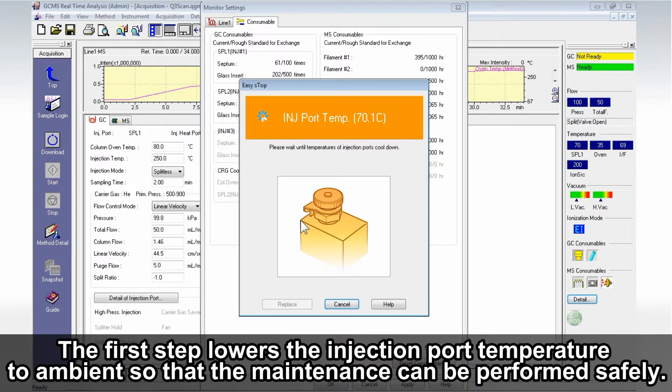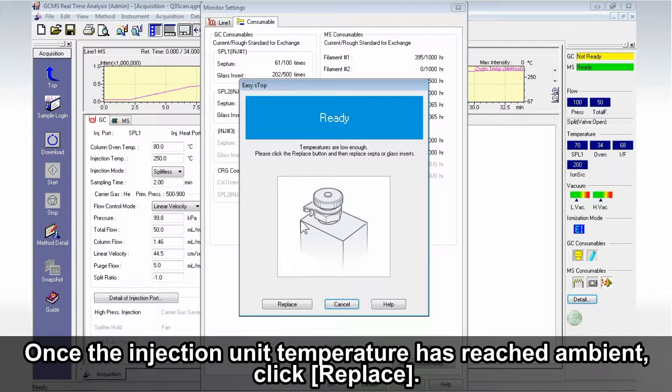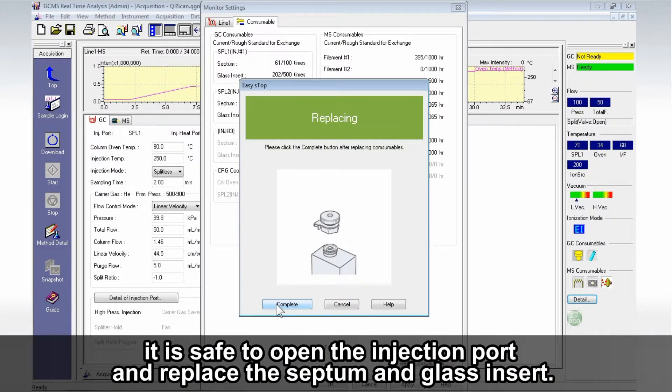The first step lowers the injection port temperature to ambient so that the maintenance can be performed safely. Once the injection unit temperature has reached ambient, click Replace. When this screen is displayed, it is safe to open the injection port and replace the septum and glass insert.